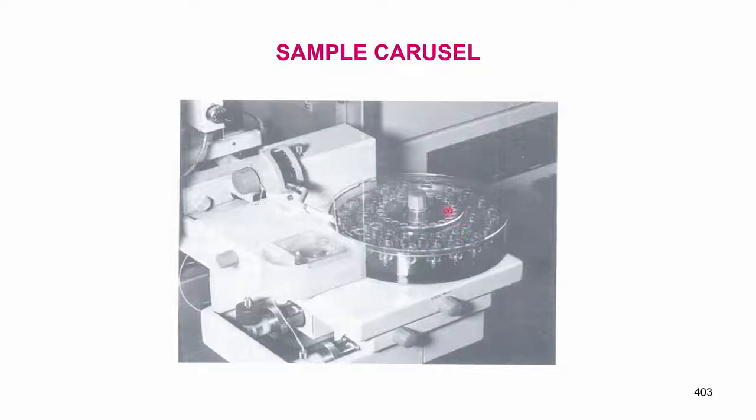All I have to do is prepare all the samples to be put in these holes and then go for coffee or lunch or something and come back. By the time you come back, everything is automated and it would be ready for interpretation. So, the whole atomic absorption process can be automated using this kind of sampler.